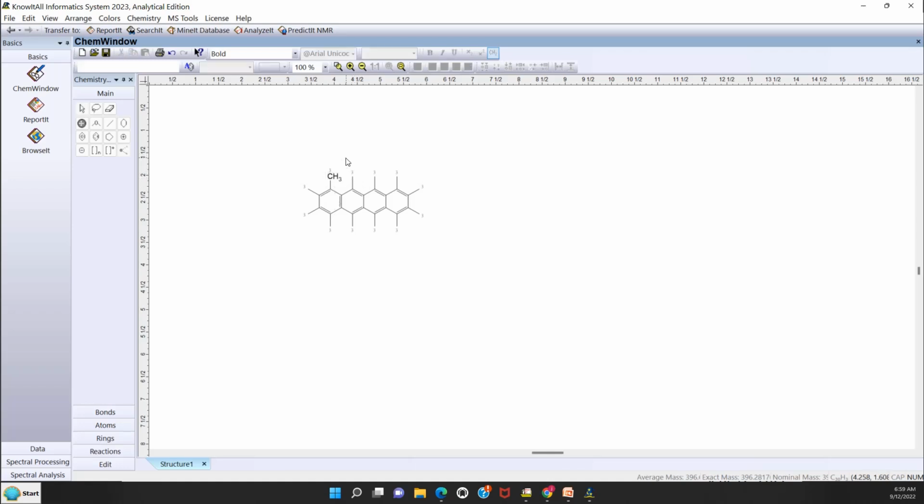Now if you go to the next one and you hold the Shift key while you push carbon, the C key, this time, instead of carbon you get chlorine. So we're just getting the common ones they have hotkeys for. If you go over to the next one and put H, you get a hydrogen. If you hold the Shift key and put H, let's see what we get. You get another defined group that they think is useful. I'm not quite sure what that one is myself because it's not a common one for me.